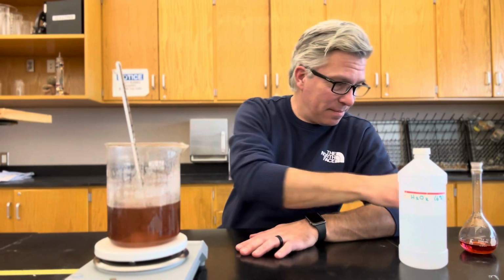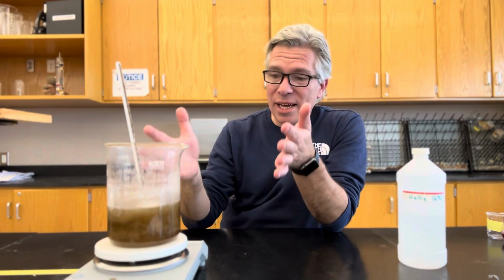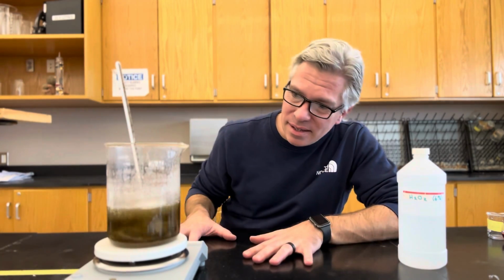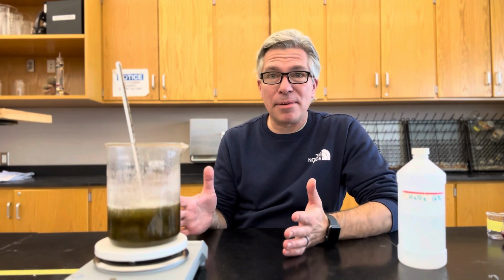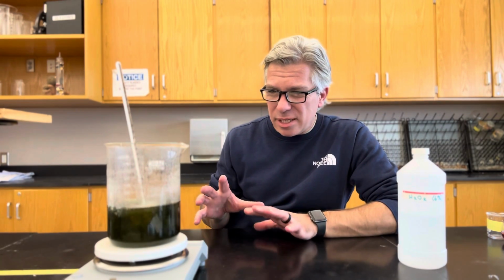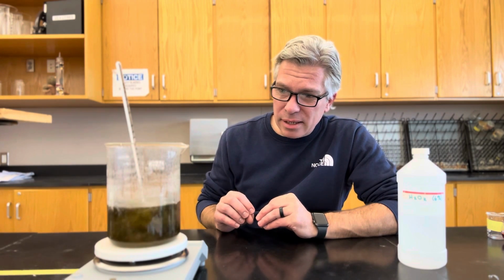a beaker. Oh. All right, check it out. We have a color change, and oh, that's awesome. So something is definitely happening here, right? And something that wasn't happening before I added the cobalt. I can sense the bubbling starting to slow down here a little bit. Not getting as much of that.